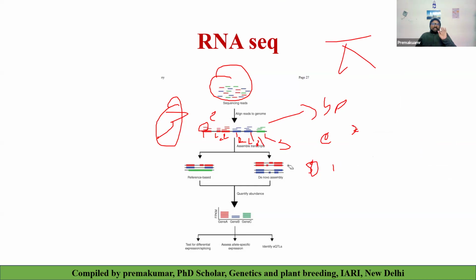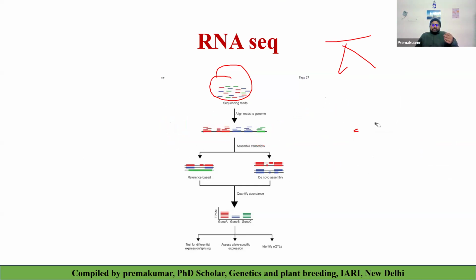But in a simple way, you just need to understand what quantification means. We're just quantifying how many reads there are per exon. That is called quantification.